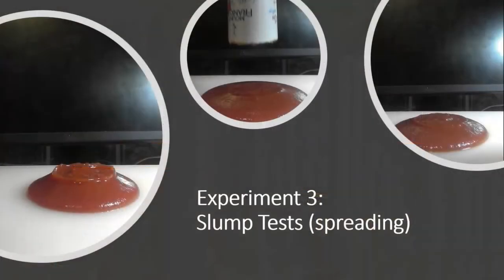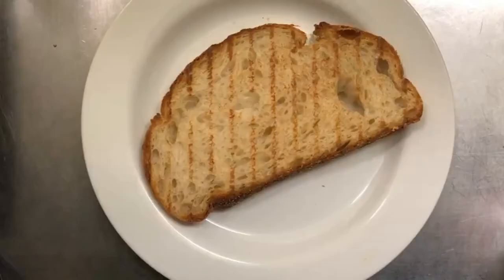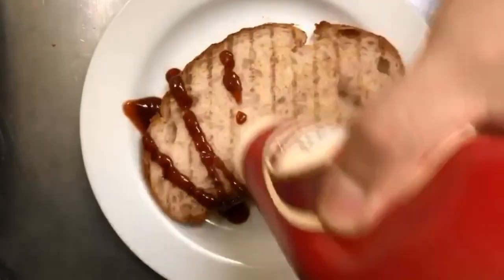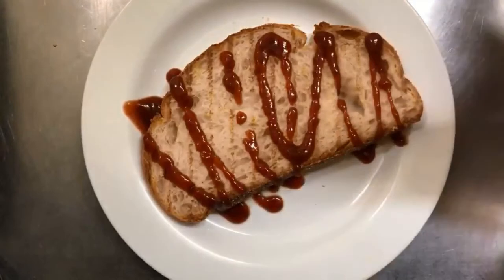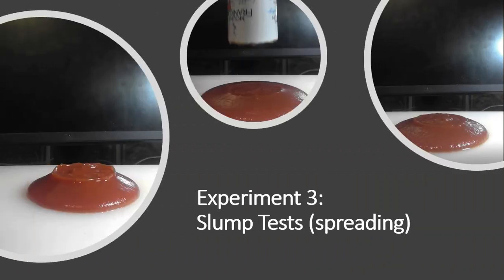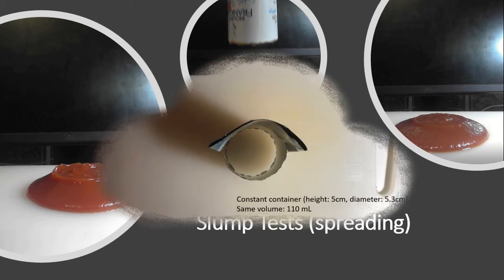In the third experiment, we are continually focusing on the using stage. After squeezing it, maintaining the tomato sauce on food is another performance we need to consider. For example, if its flowing property is like water, it will flow into the holes on the bread and be absorbed. This will make the sourdough wet and lose its crispy texture. Regarding this performance, we do the slump test to compare the different yield stress.